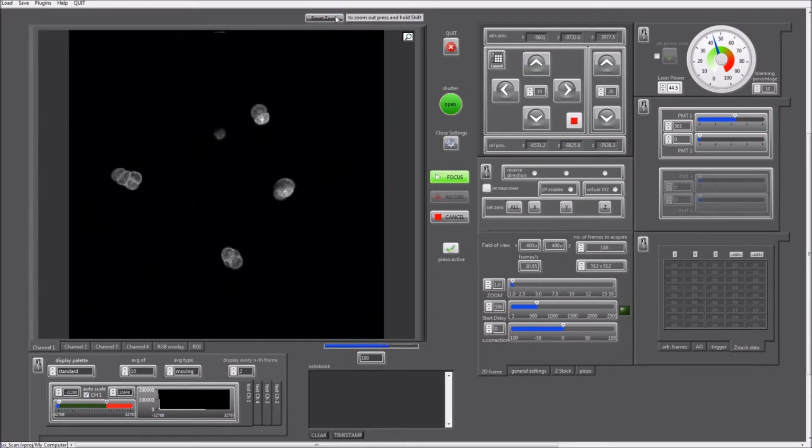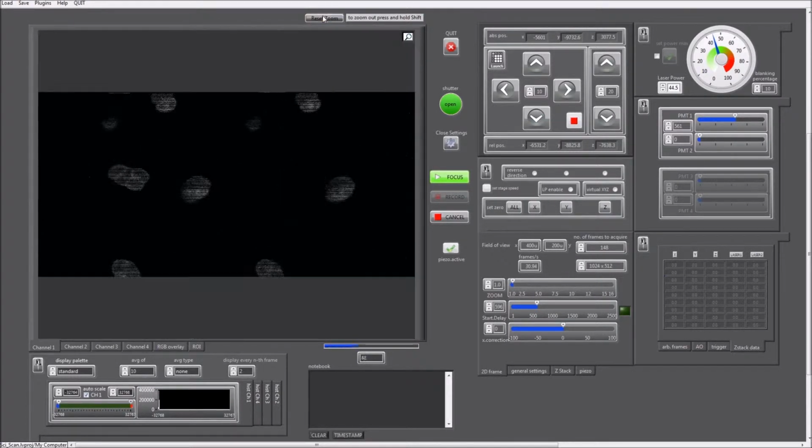So that start delay value is a rather important concept here, so I want to talk about that a little bit more. If you change your scan resolution, for example, to a 1024 x 512 image, you'll sometimes find that when you reset the zoom here, there are comb artifacts, and the forward and backward line are really very far spaced apart. In cases like this, you will first have to correct the start delay manually before using the auto calibrate button. So I'm going to do that here now.